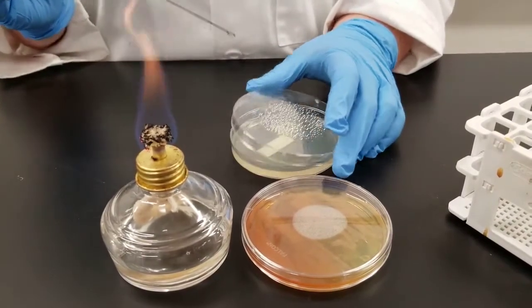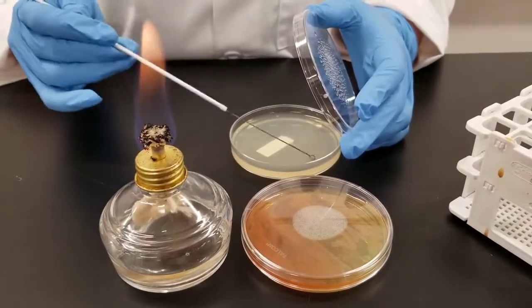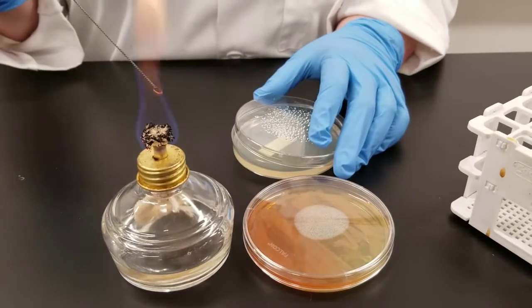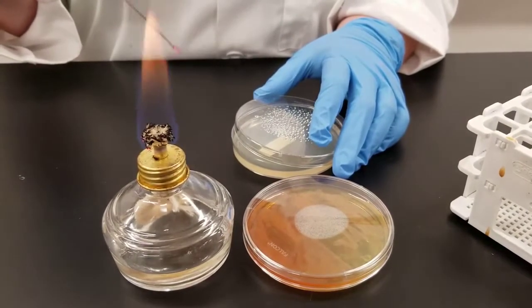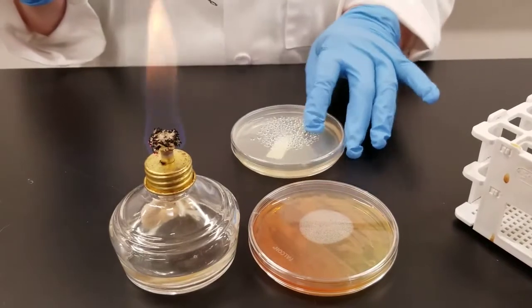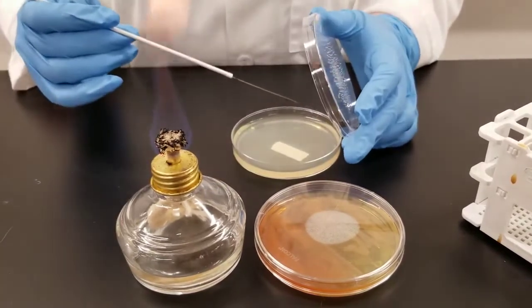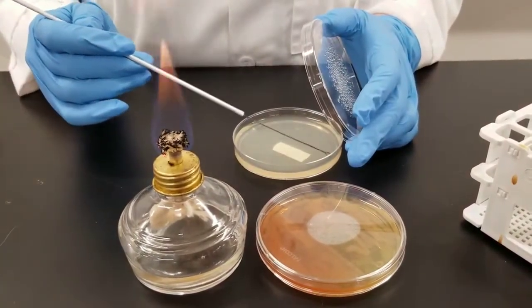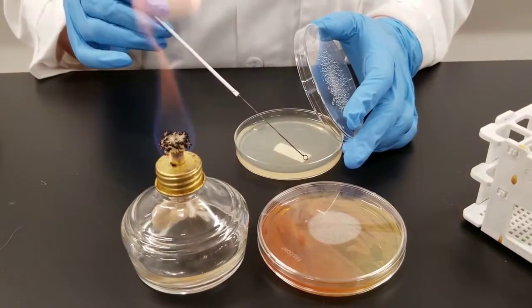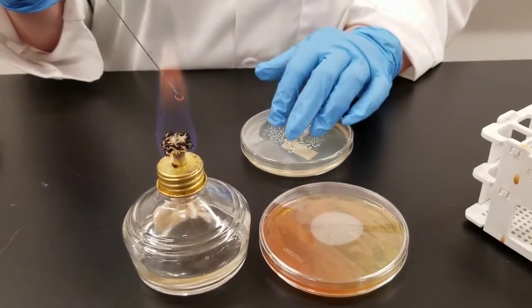I'm going to do a streak isolation. We want to end up with individual colonies. In this first area I'm going to do a heavy streak back and forth. Now I'm going to flame my loop and let it cool. I do not go back into the stock plate — I'm going to go back into the area that I just streaked. That is where my inoculum is. You may want to turn the plate 90 degrees to help with that. Go into the area you just streaked, that is where you're pulling your inoculum from. Streak out. Now I flip the loop over at this point, go into that second quadrant area and streak out.